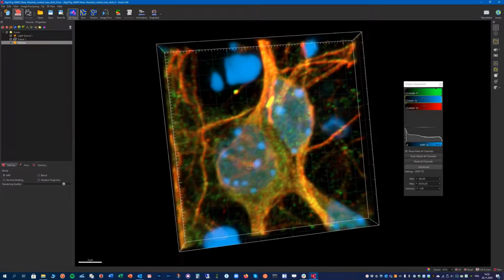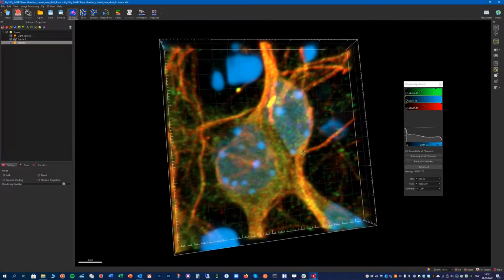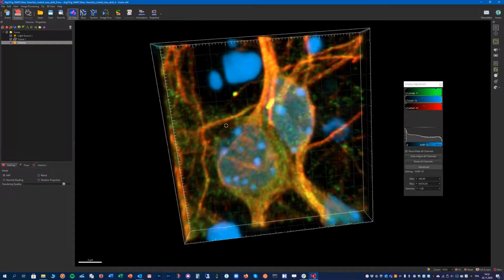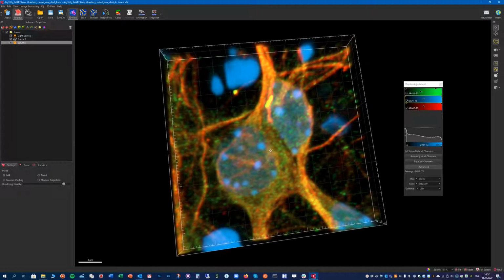As you can see, the aspect and the representation of your dataset doesn't change that much here, but it will give a nice improvement in the speed of the calculation. So let's add our Cell component here.